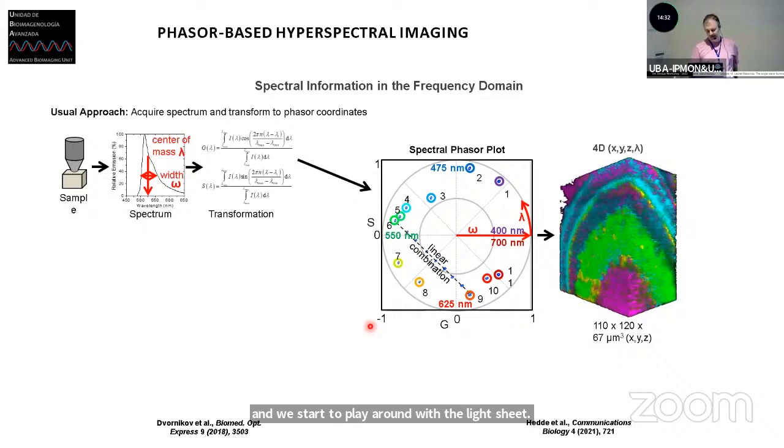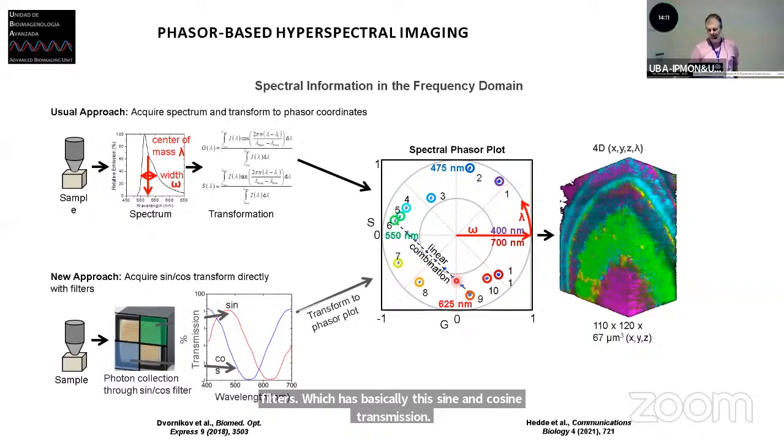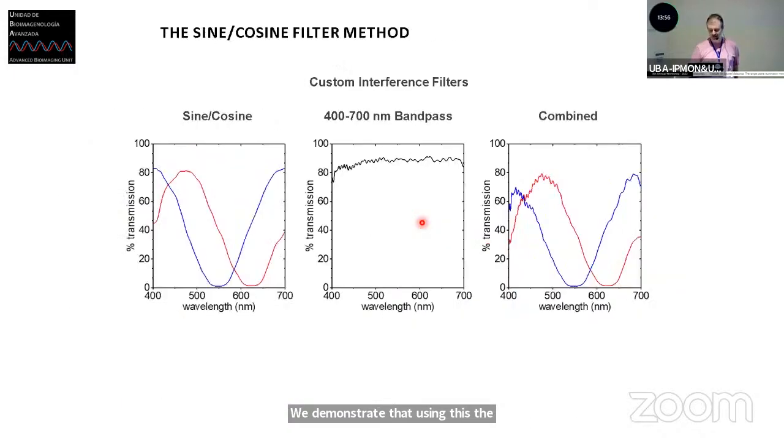So the concept is probably already in your knowledge, because we went through it yesterday. You can collect the spectra and do the phasor transformation, but we can also collect photons through filters which have basically this sine and cosine transmission. And this is basically an acquisition of many dyes using spectral and sine cosine filters. And we demonstrate that using this approach, we can recompose exactly the same data that you obtain with the spectral.